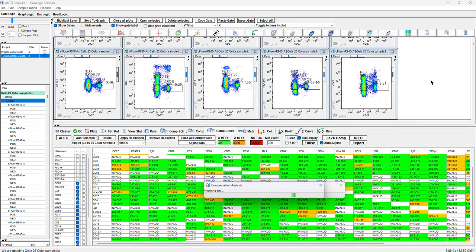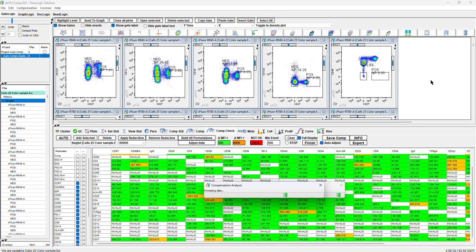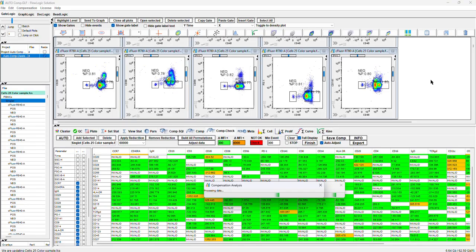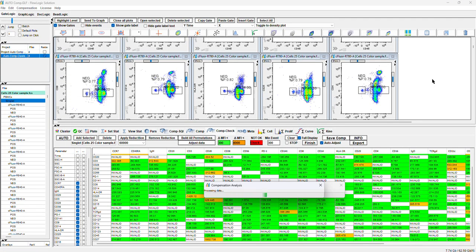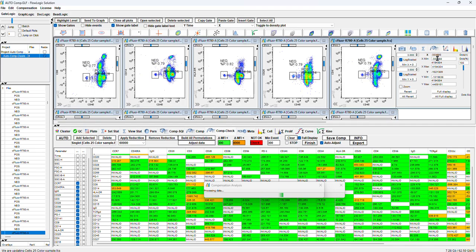We don't suggest that. We think that we let Flowlogic finish the process and then we check the result eventually. But meantime, while Flowlogic runs, the user can scroll, open the side row, fix whatever you want to fix. This is your compensation. If you need an adjustment, you can adjust your compensation.